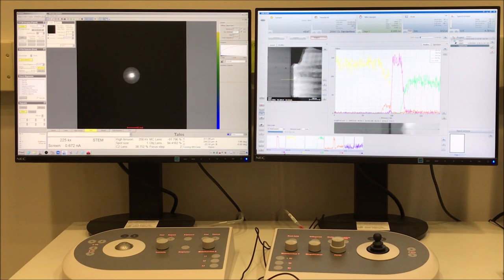On the bottom there, you can see those are the individual scans. If I want to change the color, there's a little color square. If I click on each of those, I can change my colors accordingly. Red, blue, green should always be your first three. After that, it's kind of wishy-washy as to what the convention is. I think I'm using magenta and then a teal color. Yellow doesn't show up too well.